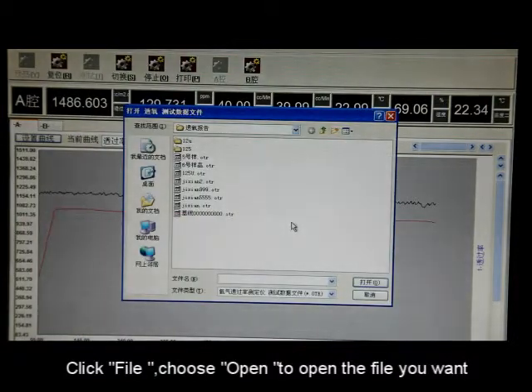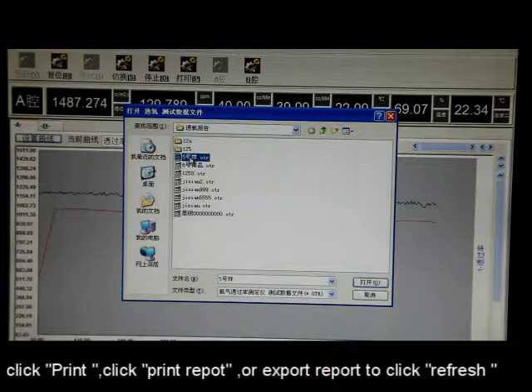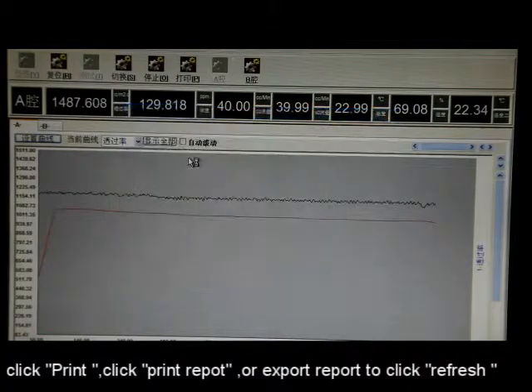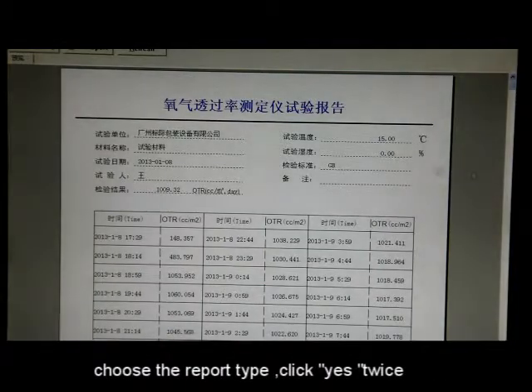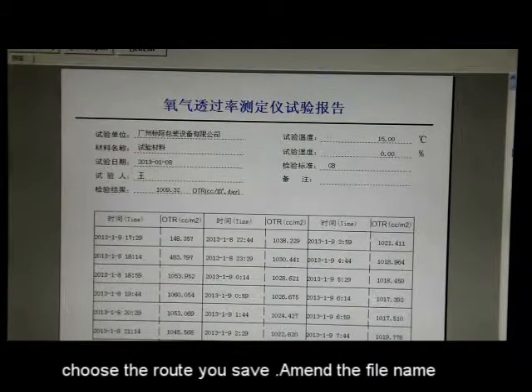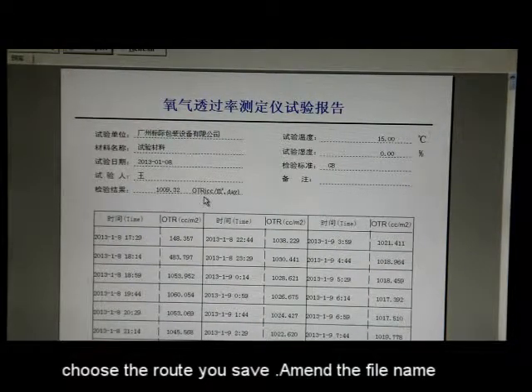Click File and choose Open to open the file you want. Click Print, then click Print Report or Export Report to print. Click Refresh, choose the report type, and click Yes twice. Choose the route where you saved the file and amend the file name as needed.